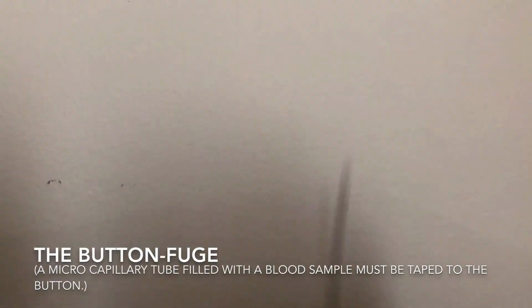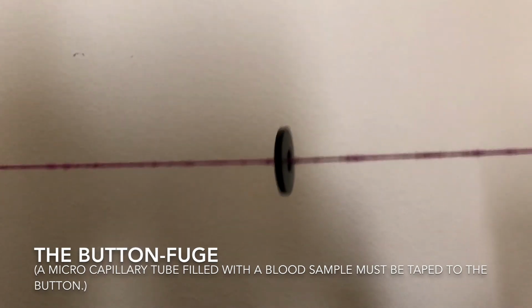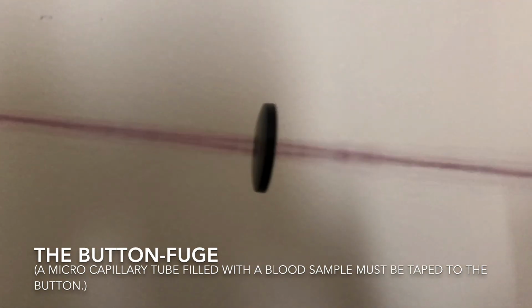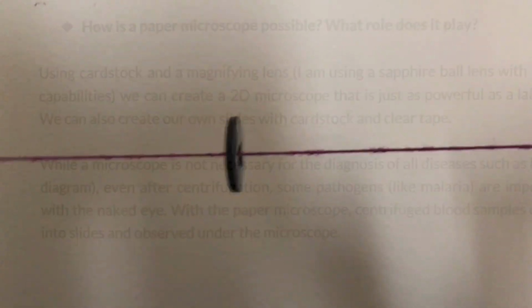With rotational speeds of up to 100,000 revolutions per minute and forces of up to 30,000 times greater than that of gravity, the device separates blood plasma from red cells from blood pathogens in less than 5 minutes without electricity and can be manufactured for less than 20 cents.